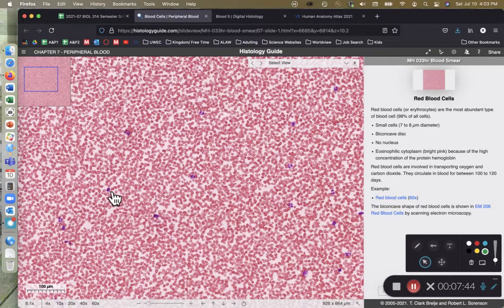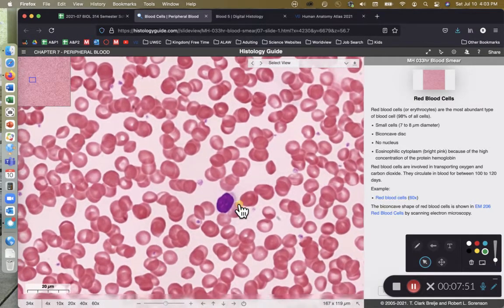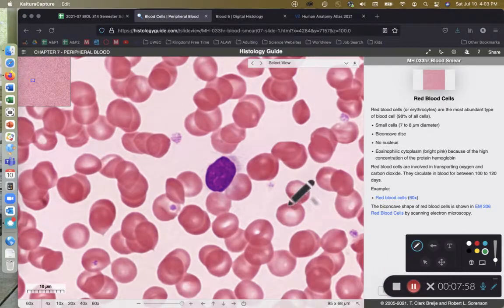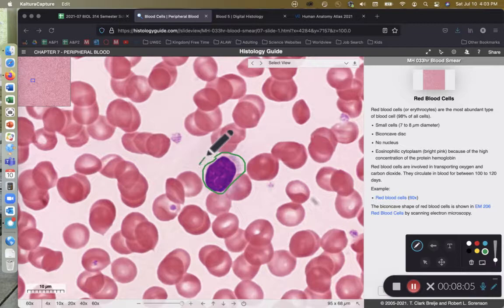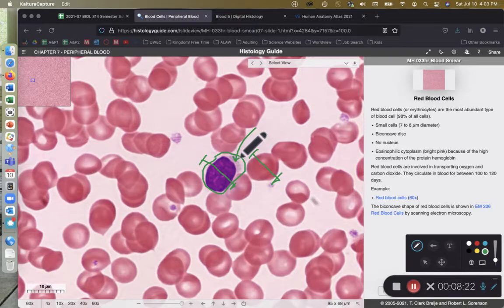Lymphocytes are about the same size as an erythrocyte. They are characterized by having a nucleus that fills up almost the entire cell with very little cytoplasm. Here is our lymphocyte. Notice the diameter of our lymphocyte here is about the same as the diameter of an erythrocyte — about the same size as a red blood cell. You can see just a tiny bit of cytoplasm; the overwhelming volume of the lymphocyte is made up of its nucleus.